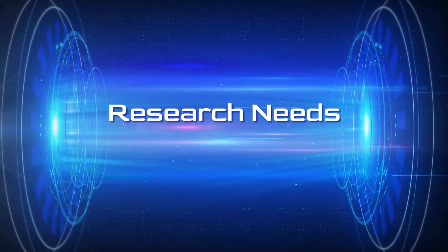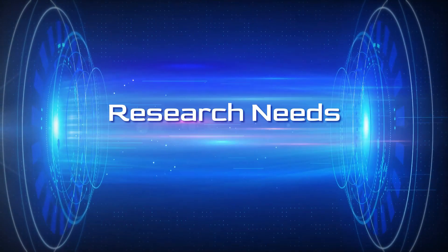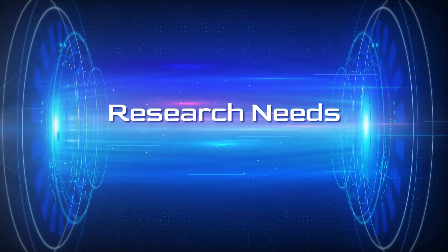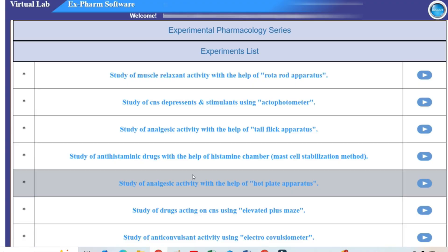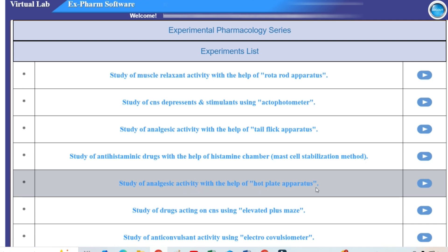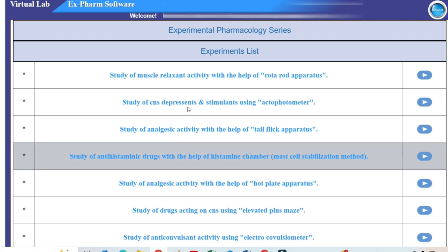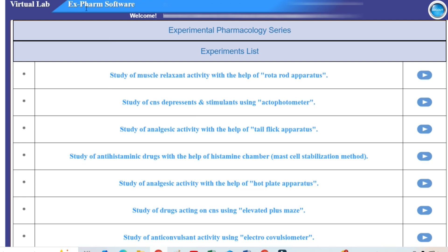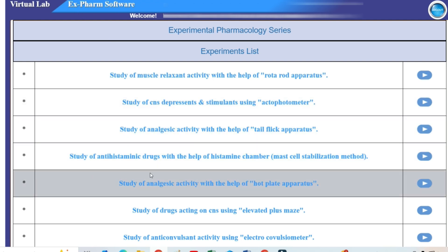Hello friends, welcome to Research Needs. In this video we will see a new experiment study of analgesic activity with the help of hot plate apparatus. We are going to use Ex-Pharm software to understand this activity and how to use the hot plate apparatus.